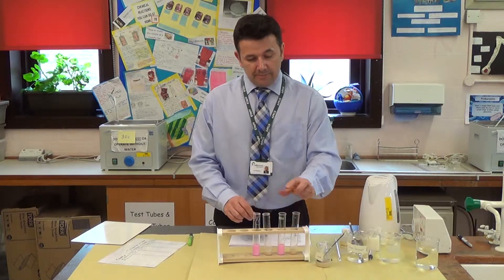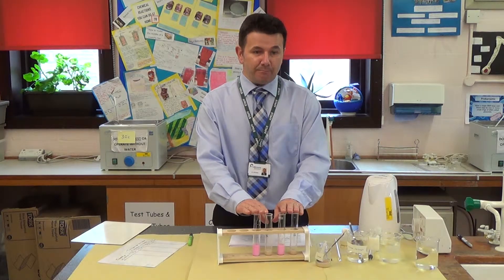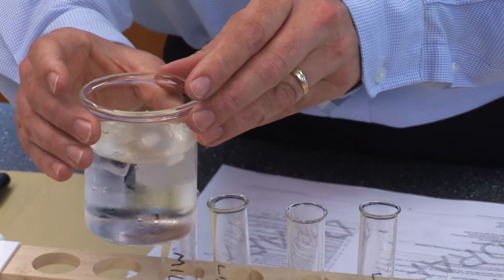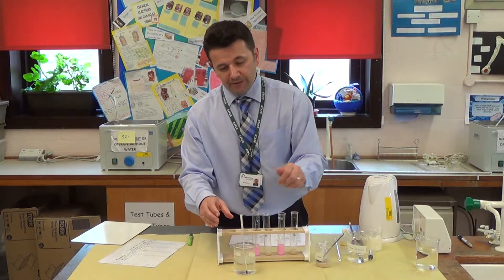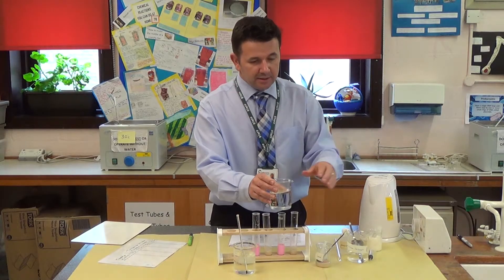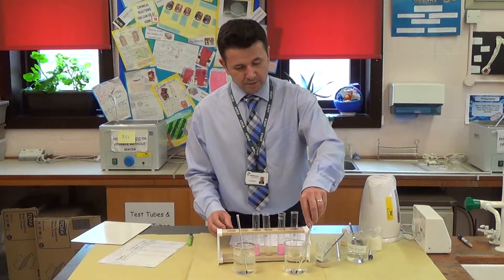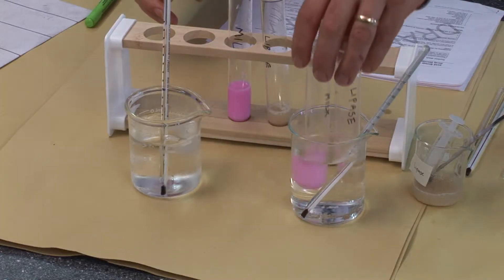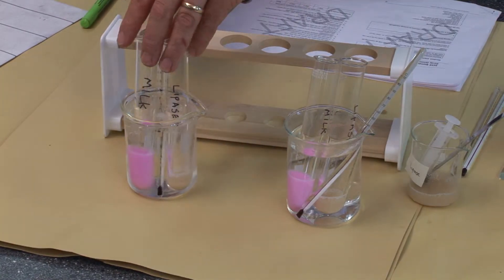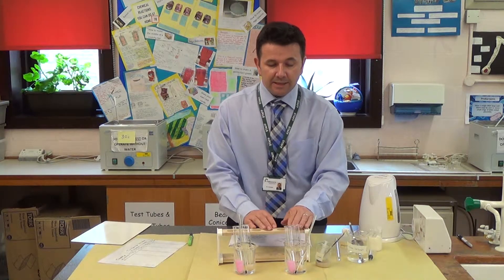Before we add the lipase to the milk, we're going to put the tubes into different water baths, because we're looking at the effects of temperature. I've got a cold water bath — remember to measure its temperature — and some hot water from the kettle. It doesn't need to be boiling. Place a thermometer in the water, then put two tubes into the hot water and two tubes into the cold water. I'm not mixing them together yet because I want them to reach the same temperature as the water bath first.